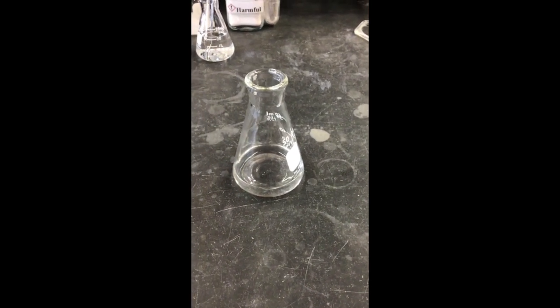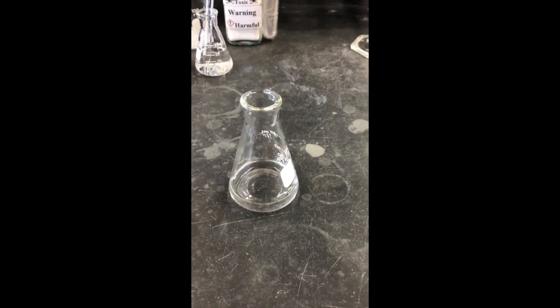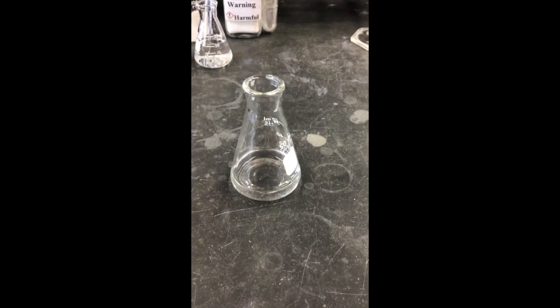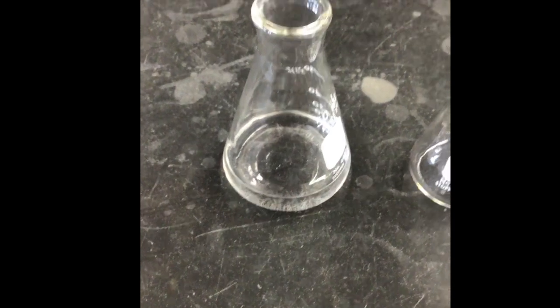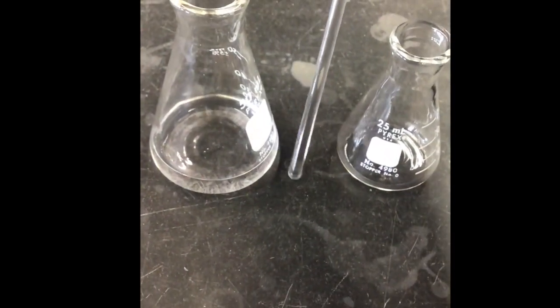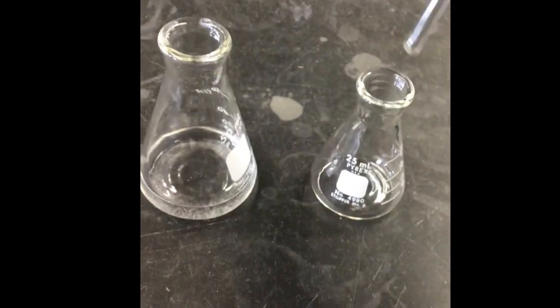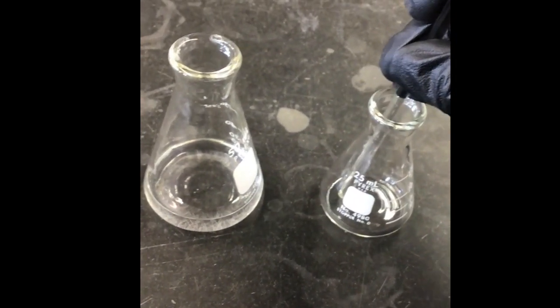What you can also do is add it to an ice bath. Just set it on ice carefully so it doesn't fall as the ice melts. And then after that, if it doesn't form crystals, then what you can do is grab a glass stirring rod. And so this guy right here. And then you scratch at the bottom like that. It's pretty much like this. So once you scratch at the bottom like that, you're scratching the glass.